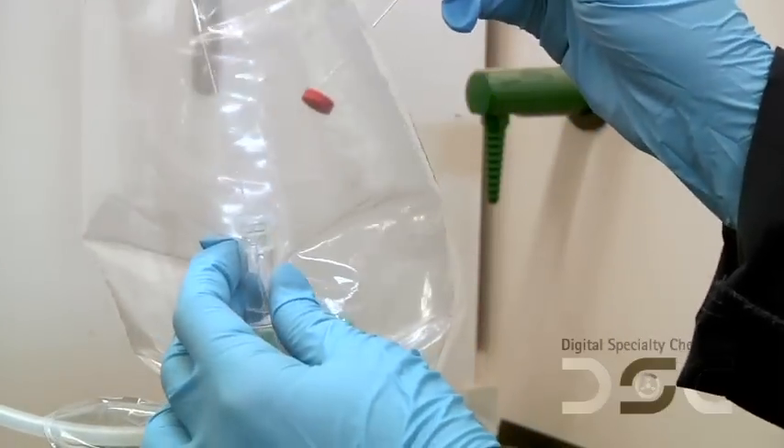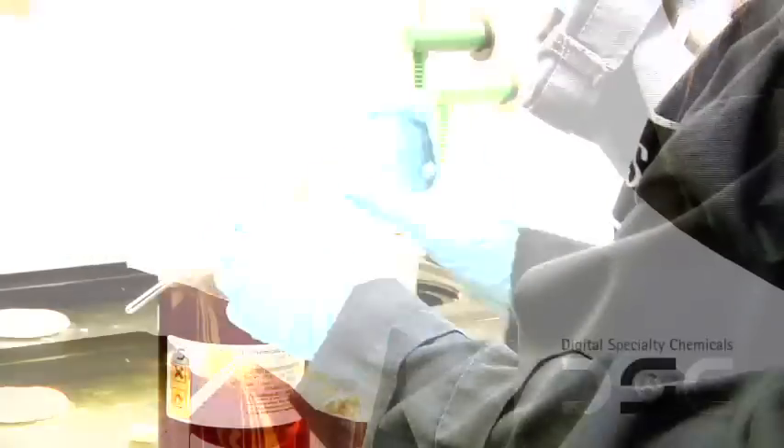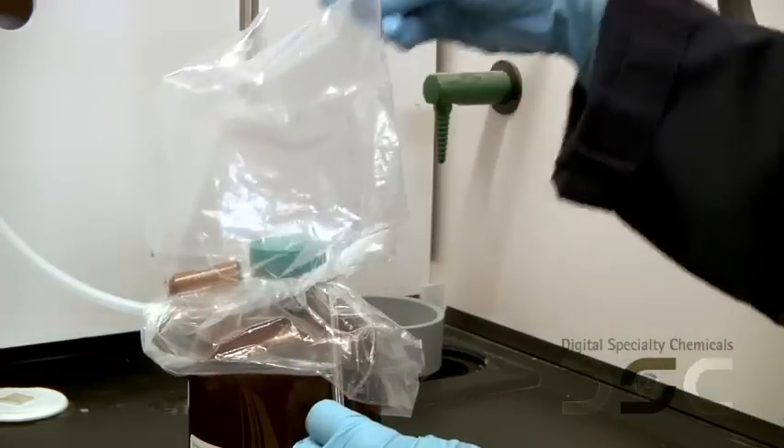The syringe tip should be capped until injection. If your analysis requires a solvent, the solvent should also be transferred to the vial or NMR tube using the same method as for the sample, before the sample is taken.